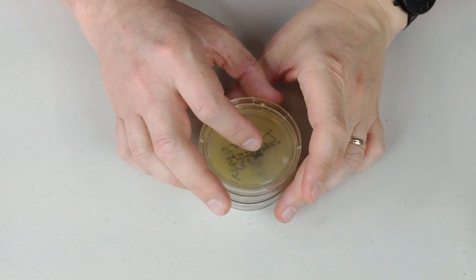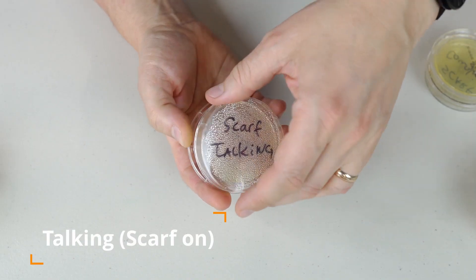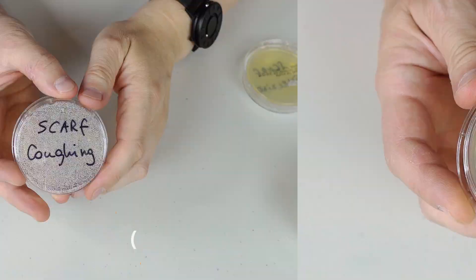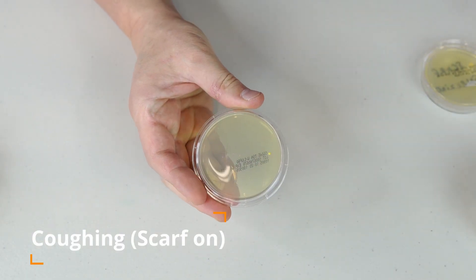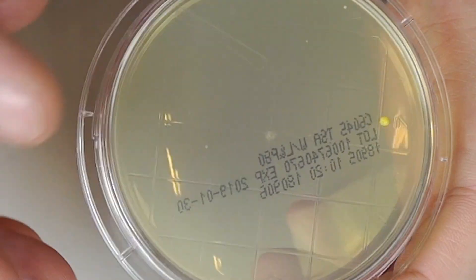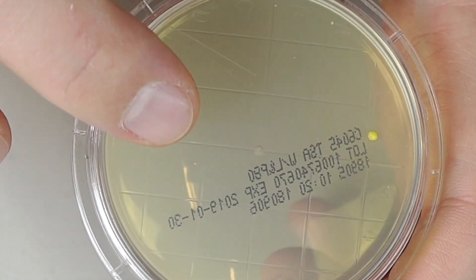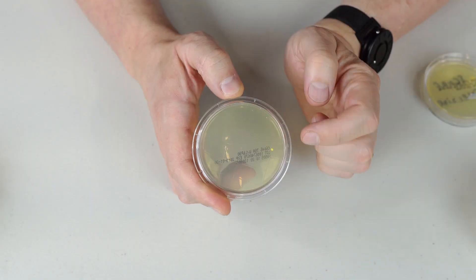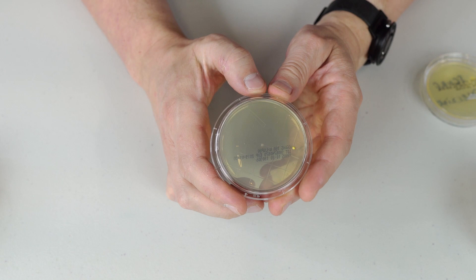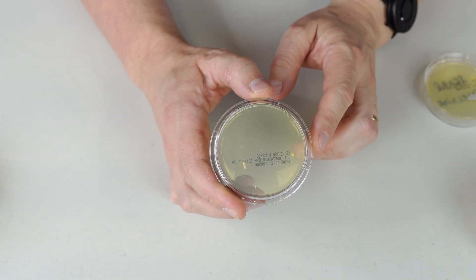This one is the one with the scarf on. Scarf on while talking — I don't see any colonies either. How about coughing with the scarf on? Oh, look at that — there is one right here, and I think I see another tiny one growing right here in this area. That's very interesting. So one, and potentially a second colony, is growing after coughing through the scarf.